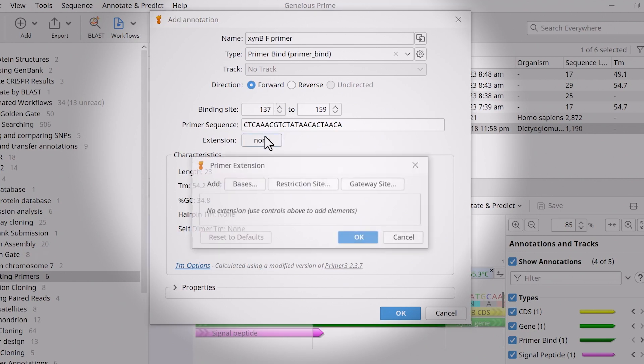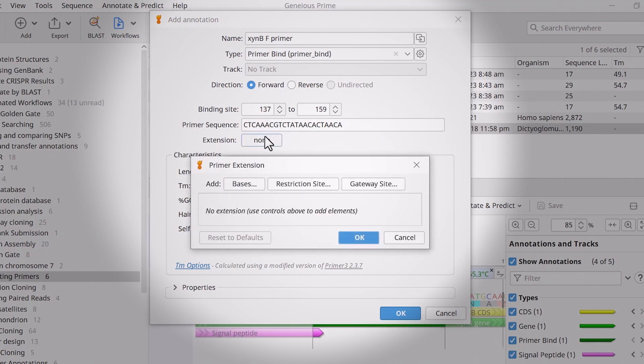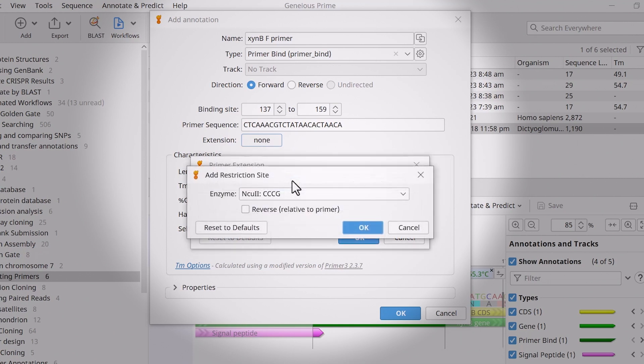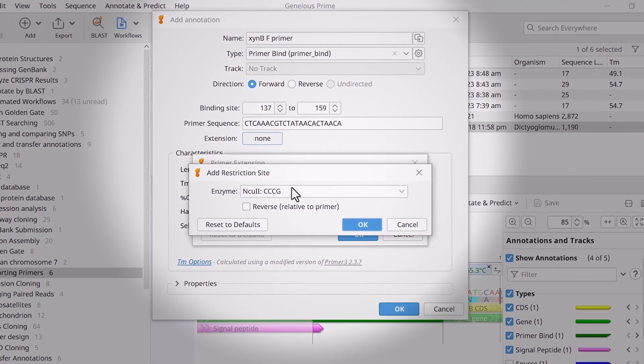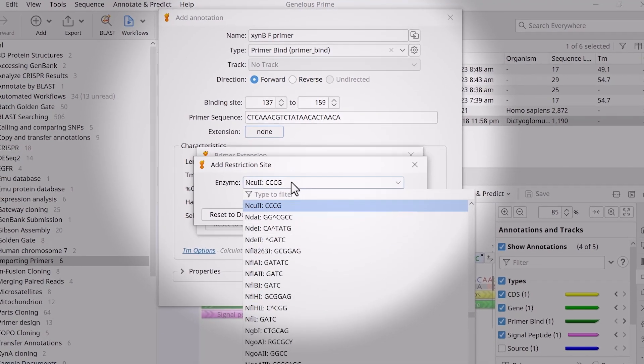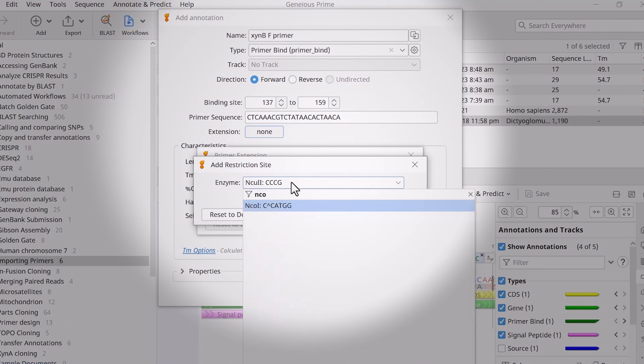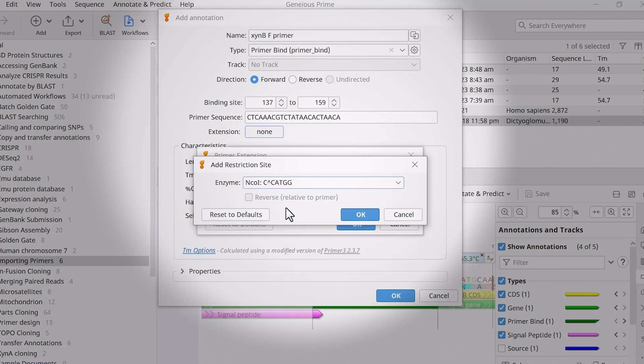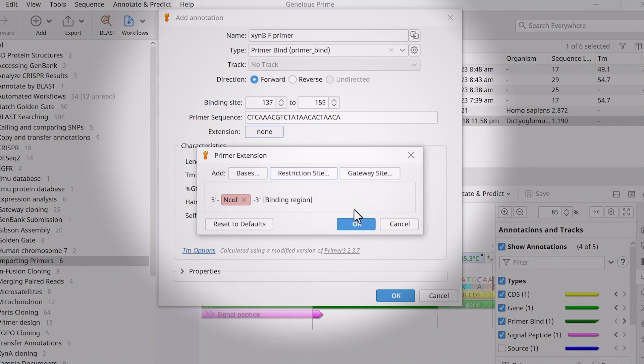To add a five prime extension to the primer, click None next to Extension. You can add a custom sequence of bases, a predefined restriction site or a predefined gateway site. For this example, I will add a restriction site. Browse the drop-down menu by scrolling or typing in the enzyme name to find the desired restriction site. Click OK to confirm your selection.